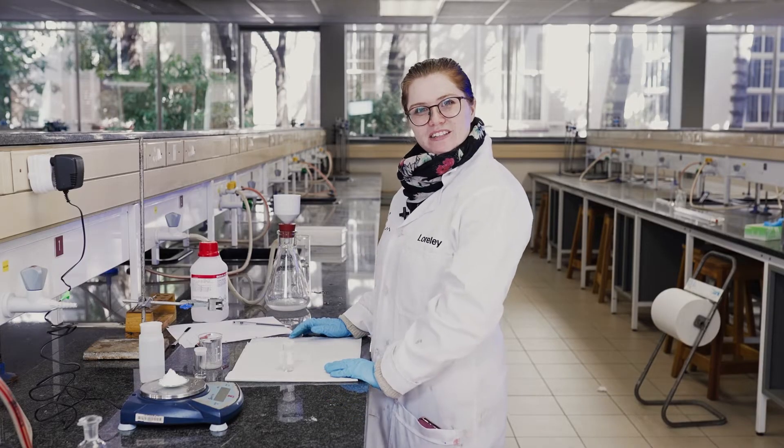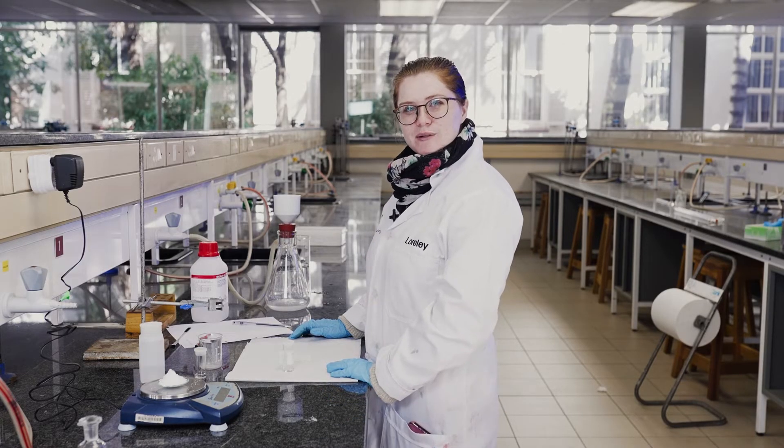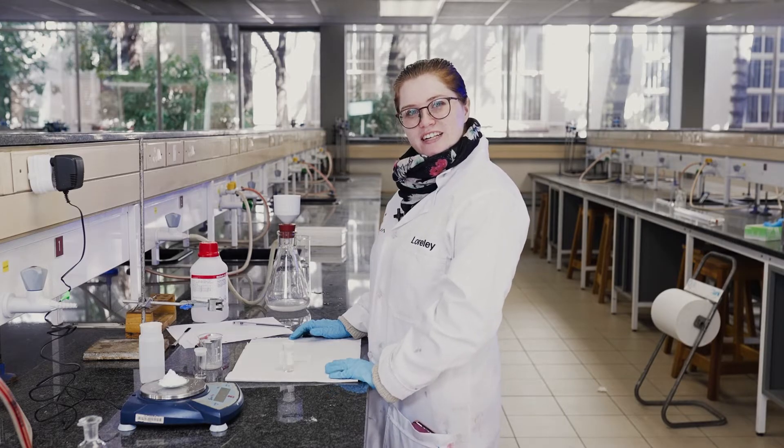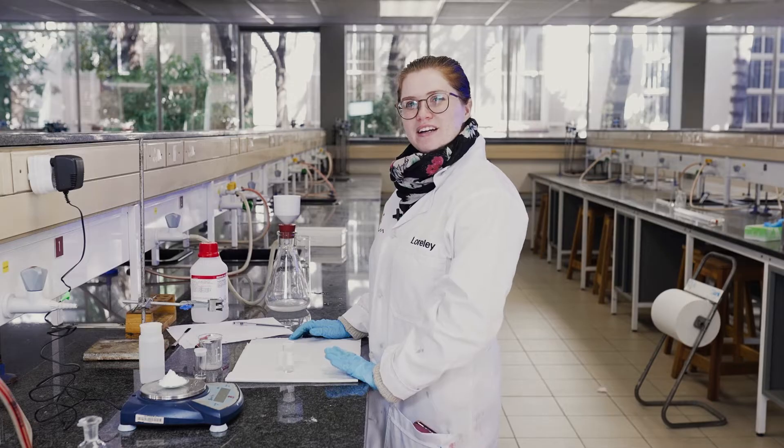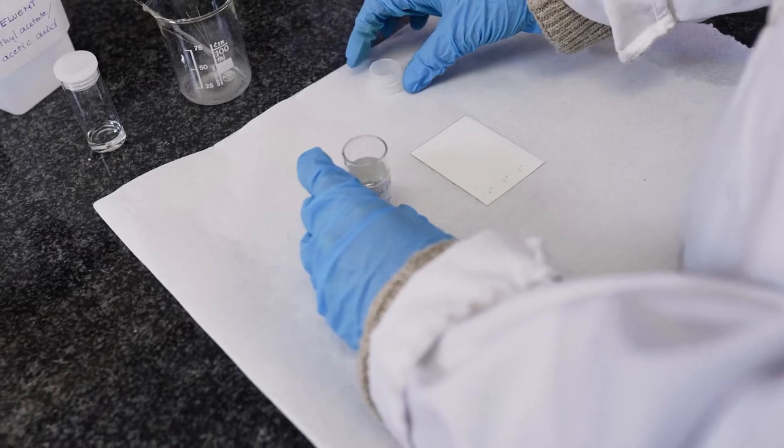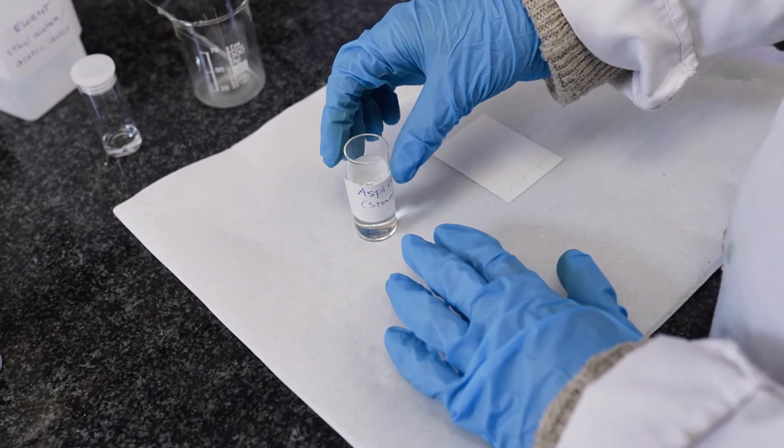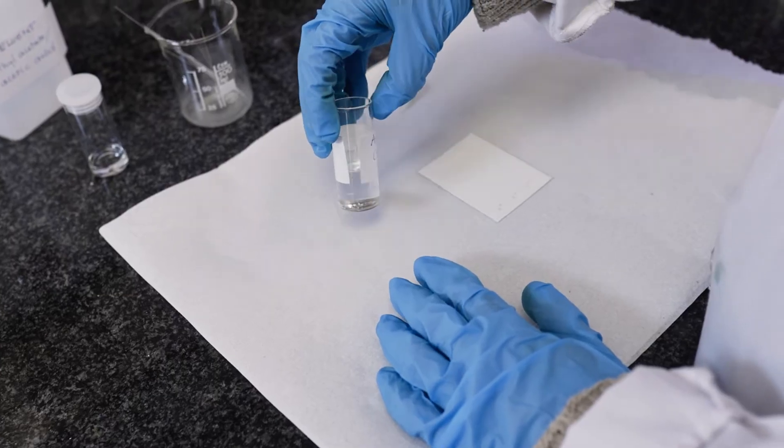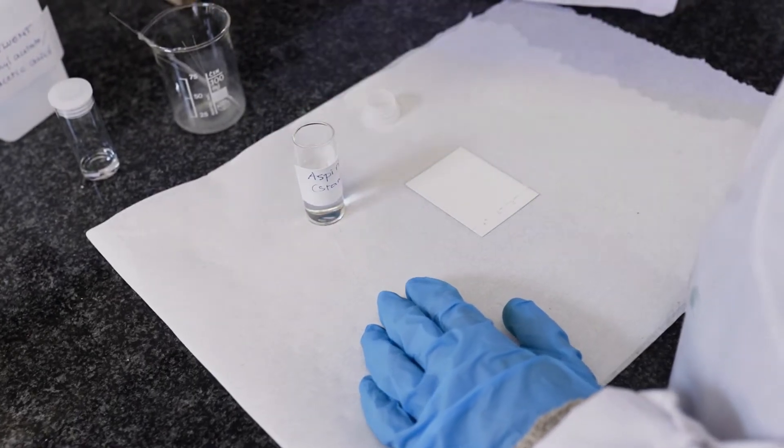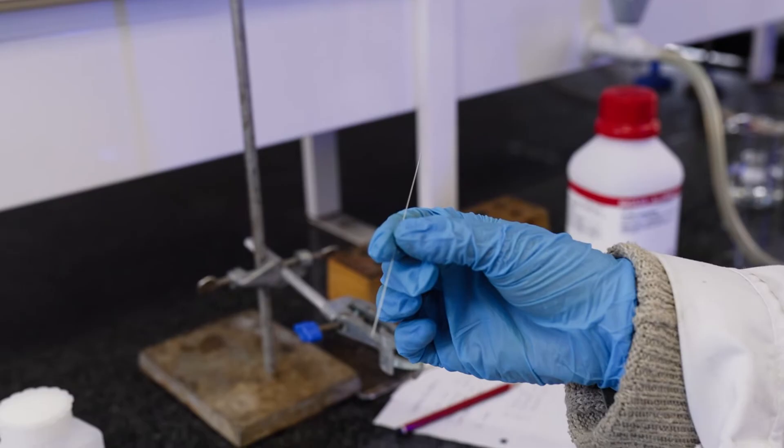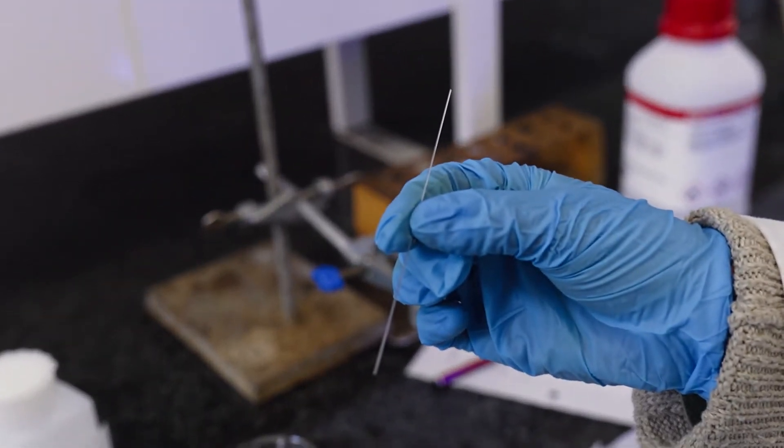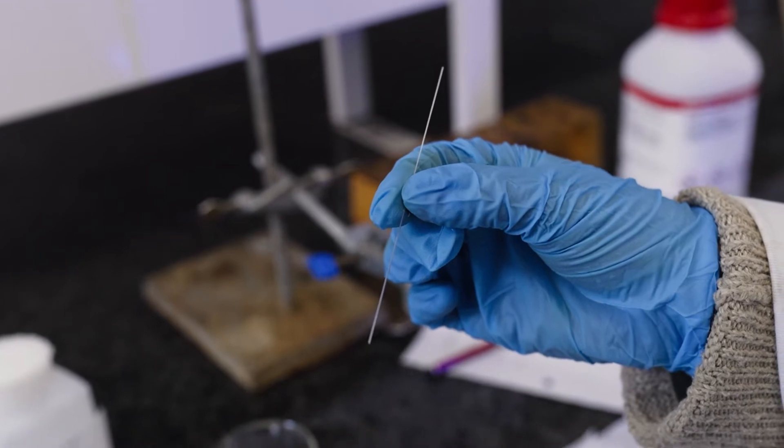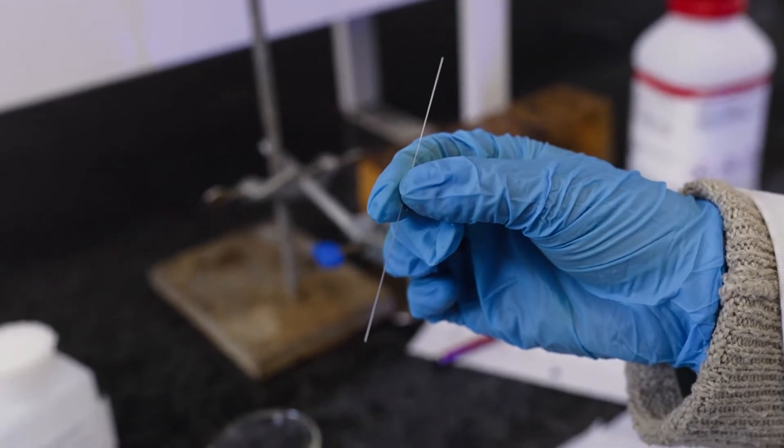So now we need to start spotting our TLC plate with our three reagents: the standard of salicylic acid, our standard of aspirin, and our homemade aspirin. We're going to take our standard of aspirin which has already been prepared for us. We're going to use a capillary tube, so this is a glass tube which is extremely thin to make sure that we only have a really thin spot on our TLC plate.